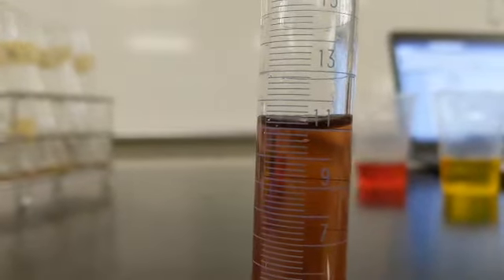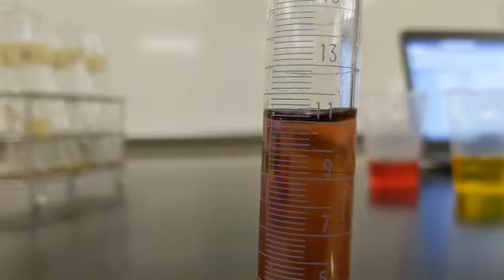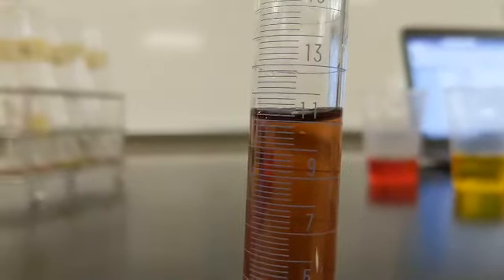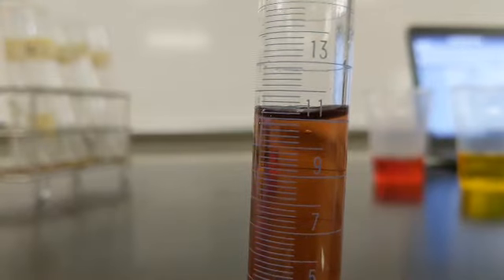I think we can call that 11, exactly, because we're measuring to the bottom of that curve, not the top, the bottom. So let's call it 11.0 milliliters, or just 11 milliliters.